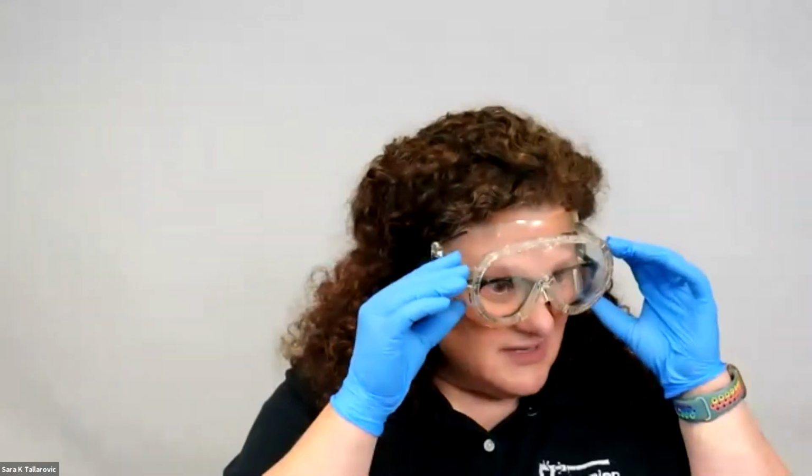All right. If we have any more questions, we can handle some of them now. If we don't have a lot of questions, I was going to show you a cool version of this lab from a different lab, but it's the exact same basic setup, and it's the effect of alcohol on membranes. I can demo that as well if you're interested. Colleen, did we have any other questions? Mary was asking if the LabQuest can transmit to GA Pro, and the answer is yes. And there's even an online data sharing mode that you can use for that as well over Wi-Fi.